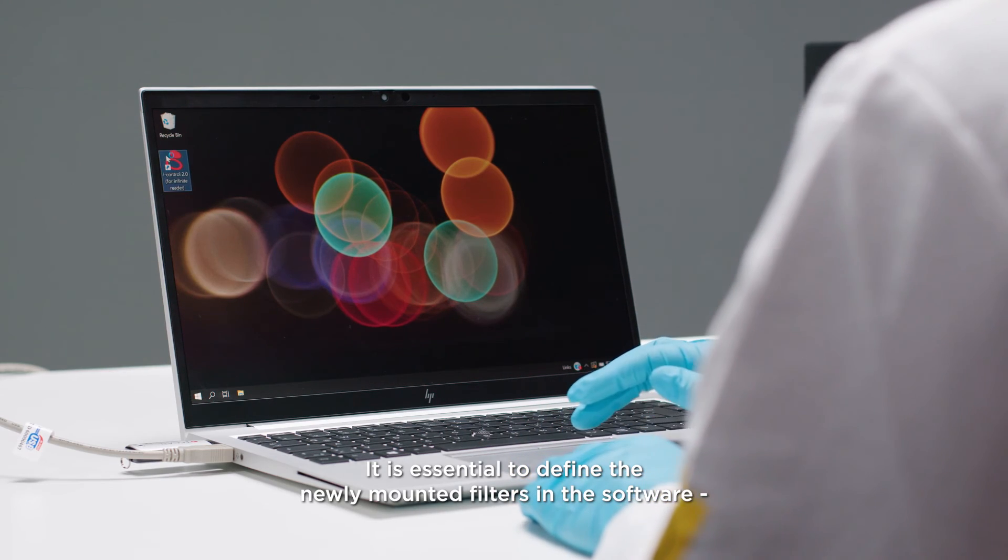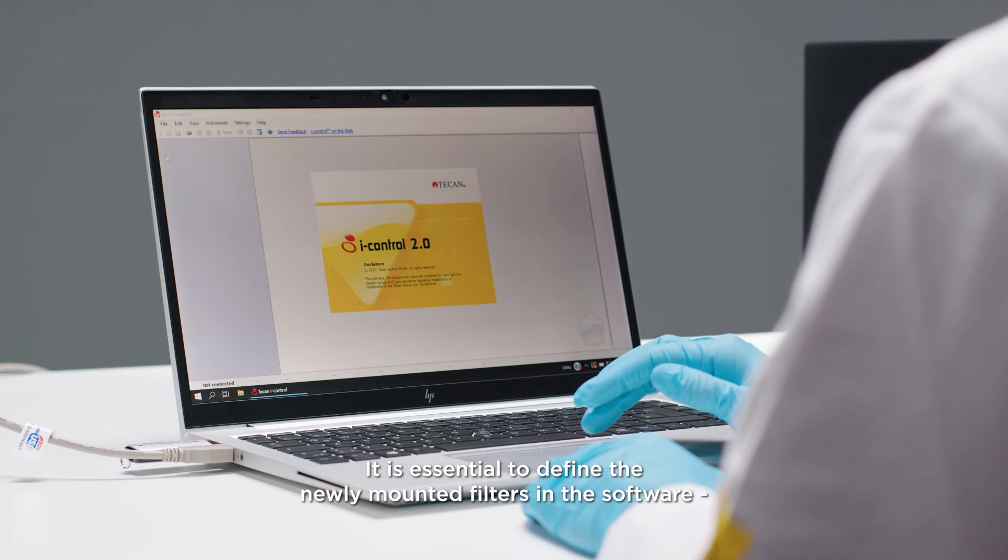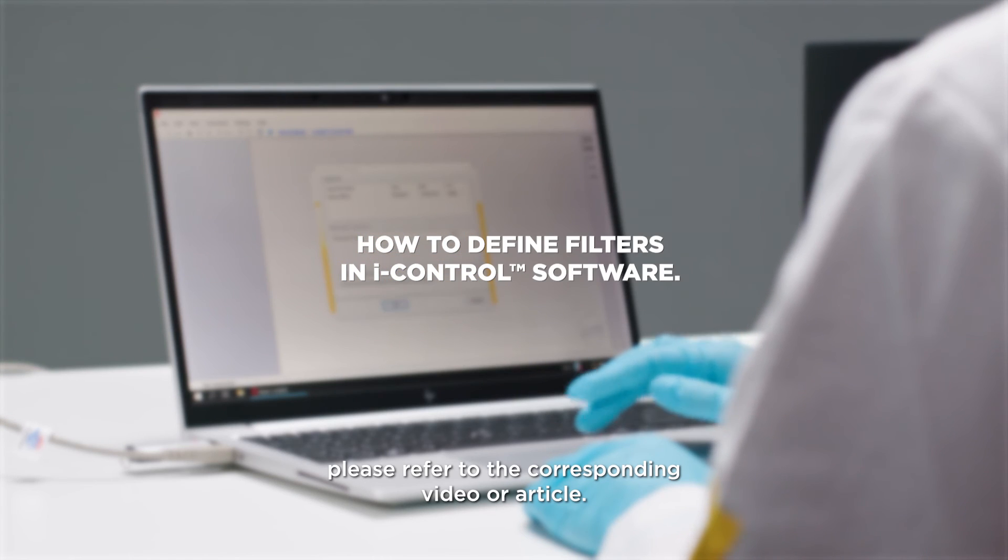It is essential to define the newly mounted filters in the software. Please refer to the corresponding video or article.